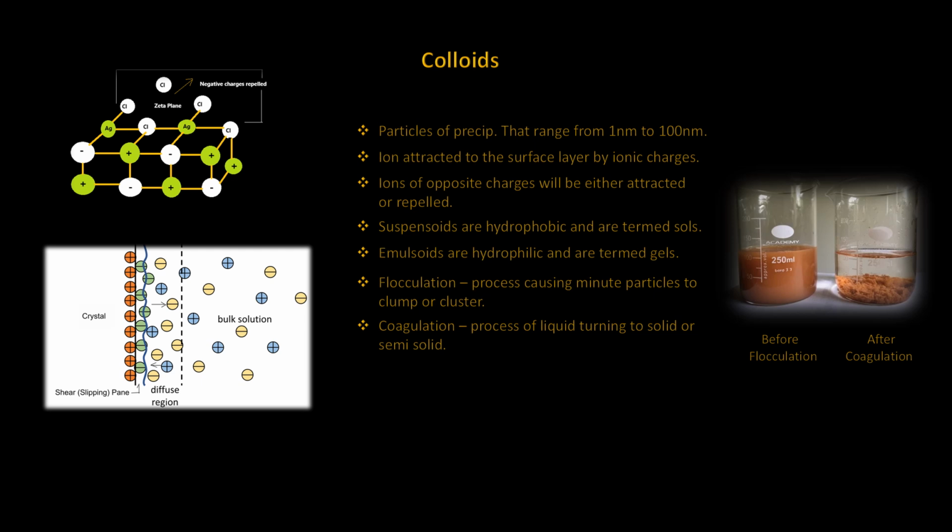The point here is that either these small crystals will pass right through a filter medium, and some be redissolved, or that the material will just plug up the pores in the filter medium, which forms a plug or clog, preventing separation of the analyte and therefore loss. Heating the solution gently while stirring allows the minute crystals to redissolve and reprecipitate to form larger crystals.